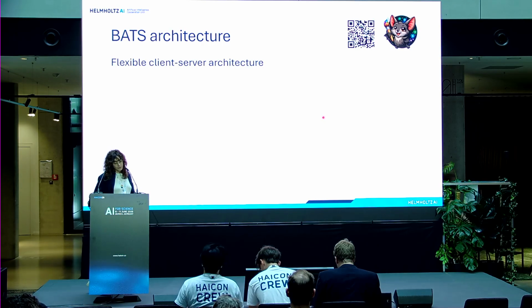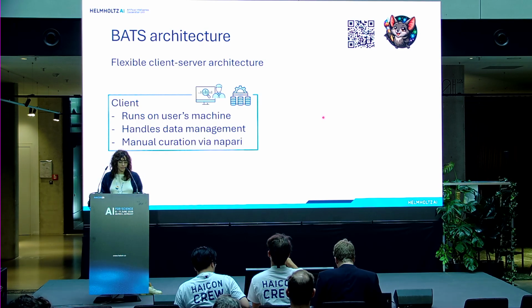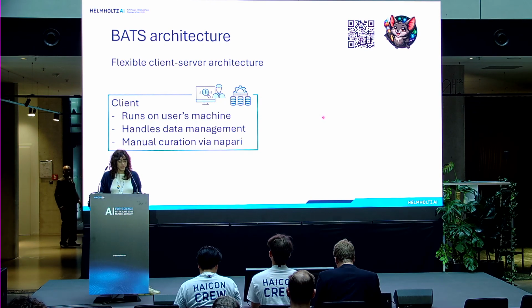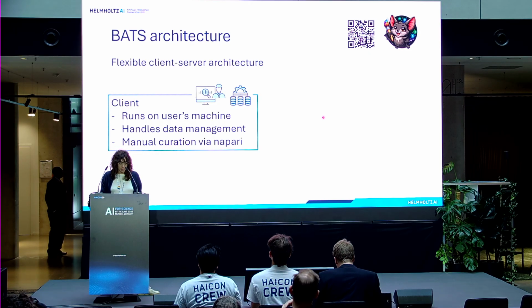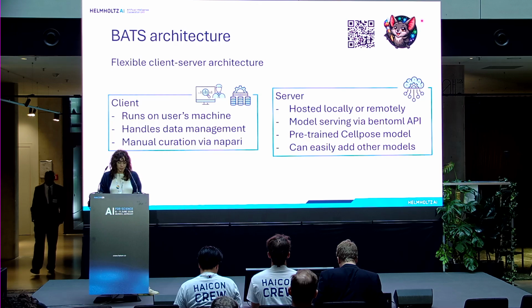So, our tool, BATS, was built with a flexible client-server architecture. On the client side, we have it running on the user's machine, and it handles all data management tasks, and also manual curation of the segmentation data is done via the Napari API. The server is hosted either locally or remotely.